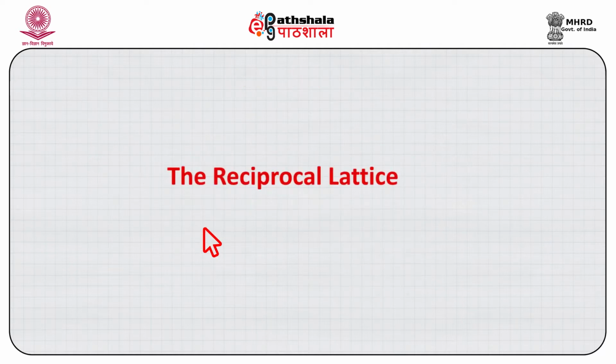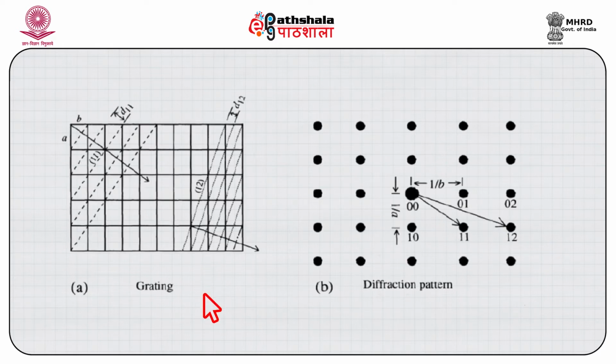For generation of constructive diffraction in 1 or 2 dimensions, the diffracted beams are produced simultaneously without any specific orientation of the incident beam in relation to the object grating. But in 3 dimensions, specific geometrical conditions are required to produce diffraction, as it requires simultaneous solution of the 3 diffraction equations. Now, in this diagram, we will have a look at 2-dimensional diffraction patterns relating the object and the diffraction pattern, following the Abbe theory which we learnt earlier.